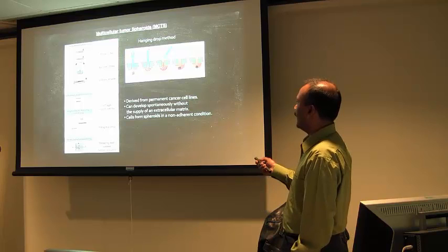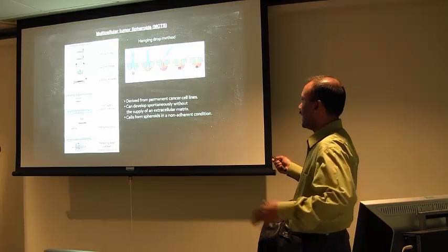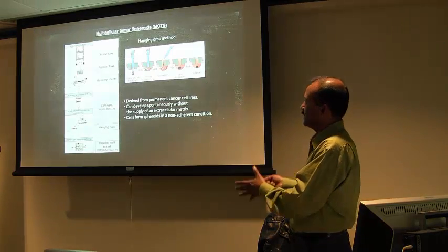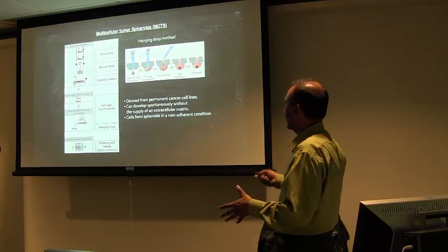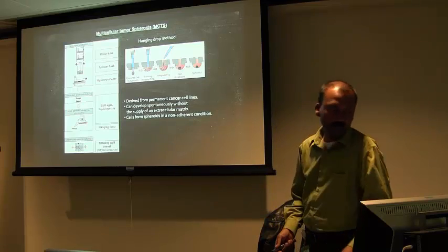But as I say, you cannot maintain cells and passage them in this format. You have to maintain the cells in a monolayer format, and then when you prepare them for experiments, you can use these kinds of plates, make the spheroid, and do the treatments and so on.